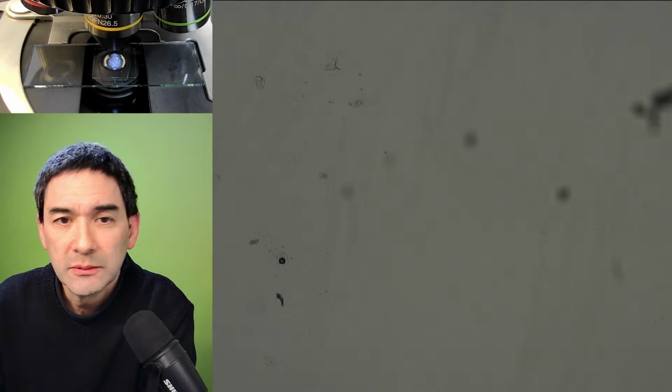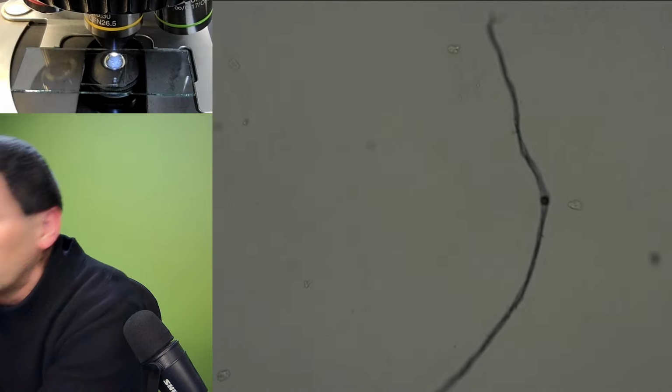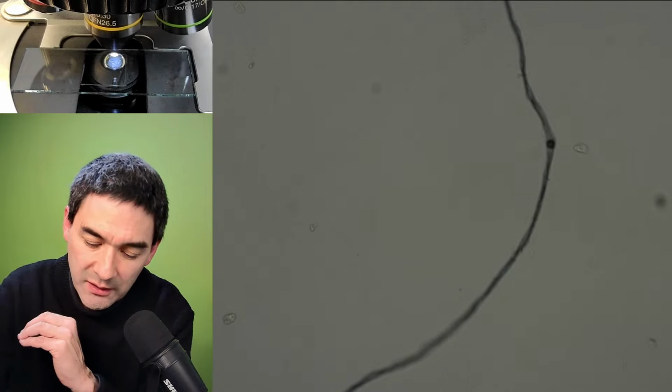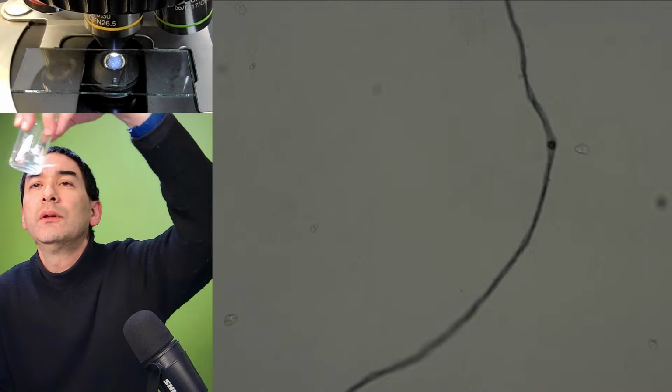Okay, and it could be that some of them, let me quickly check. Oh, that's an interesting one. Where are they? Just a second. That's what you call the demonstration effect. Why do I not see anything? I used to see so many of them. What I think could have happened is, here, it's only one. Sometimes the fibers have a different density than the surrounding water, and so they either float up or they sink. I hope I took the correct one.